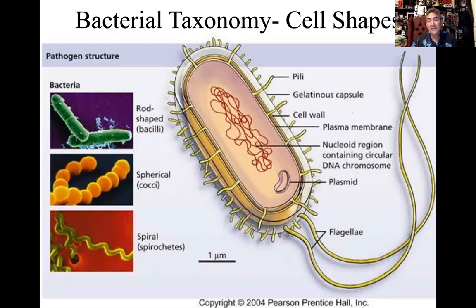But the gram stain test will then allow us to see the type of cell shape. If you're a prokaryotic cell, you're single-celled, there's a very limited amount of variation that one cell can attain. So we're going to break it up into 3 types of shapes. One single cell could be sort of oval shaped.